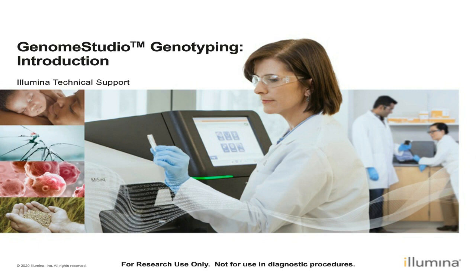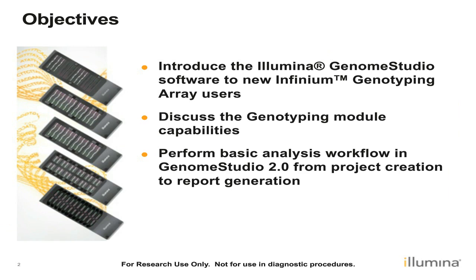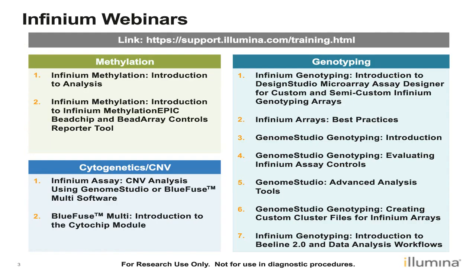So I'll go ahead and get started. Our objectives today are to introduce the Illumina GenomeStudio software to new Infinium Genotyping array users, as well as discuss the genotyping module capabilities. We'd like to show you how to perform basic analysis workflow in GenomeStudio 2.0 from project creation to report generation.